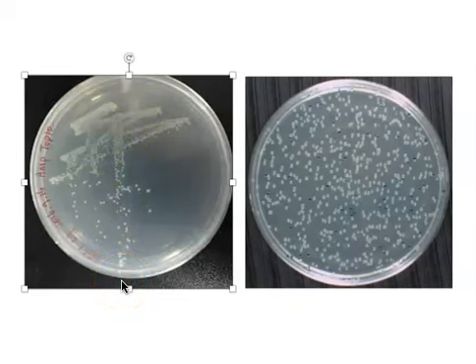We then take our inoculating loop, sterilized of course, and we dip it into a broth culture to collect some cells. Those cells are placed into the first quadrant just as a smear, just as a streak or a smear, as we would call it. The inoculating loop is then sterilized and we place it onto the plate and draw it through this first amount of cells and streak into the second quadrant, back and forth, back and forth.